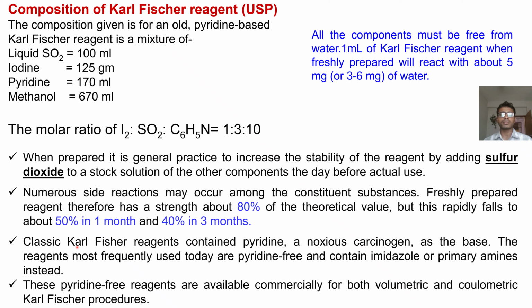Classical KFR contains pyridine, a noxious carcinogen. So that is why today pyridine-free reagents like imidazole are used. These pyridine-free reagents are available commercially for volumetric and coulometric Karl Fischer procedures.